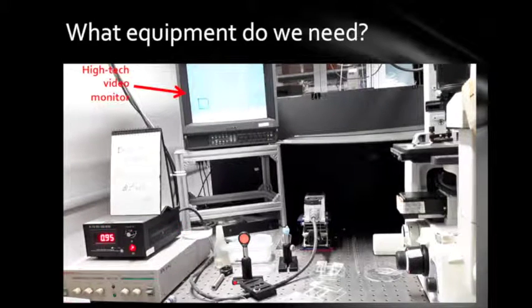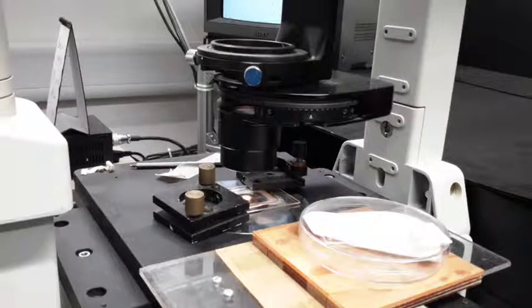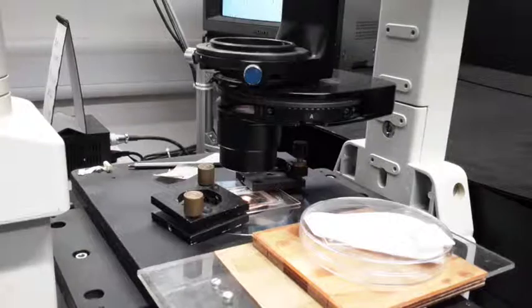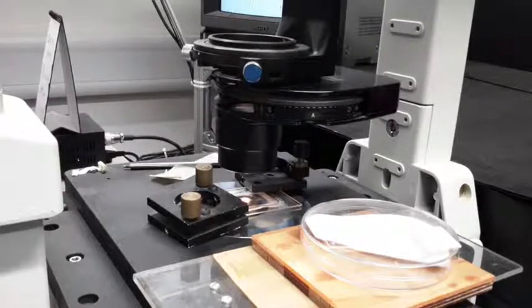So, what equipment do we need? First, a high-tech video monitor, a control box, a laser, a fancy microscope, a sample, and a CCD camera. Here, we will tell you a little about the equipment we used in our experiments. We used a helium neon laser for which we adjusted the voltage of the beam. The laser beam bounced off several mirrors and then entered the beam splitter before reaching the sample.